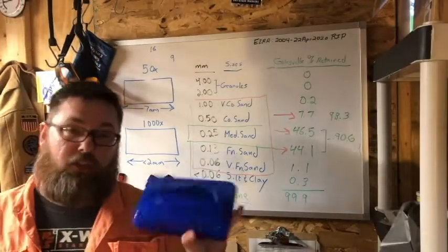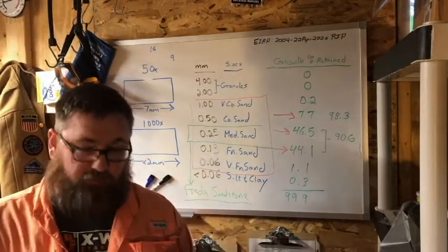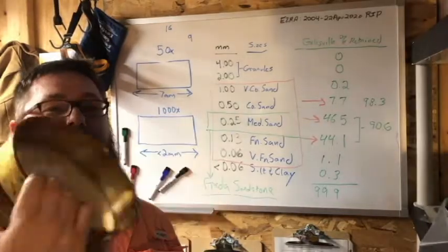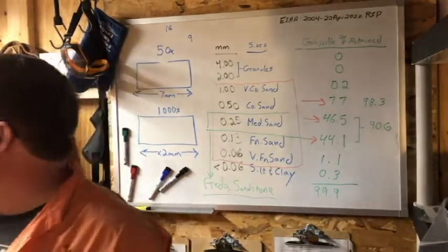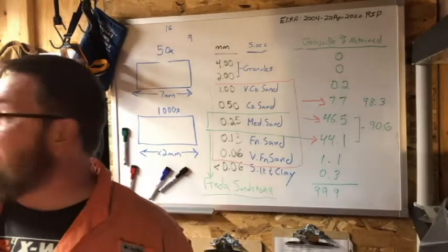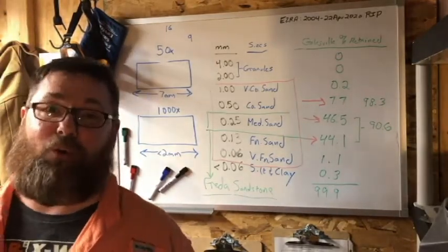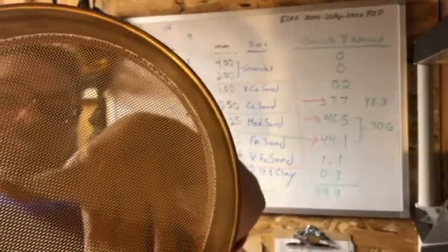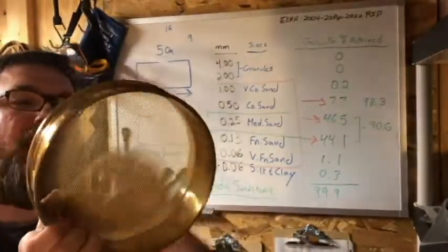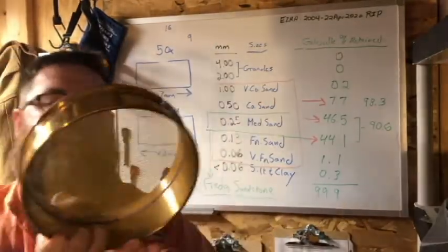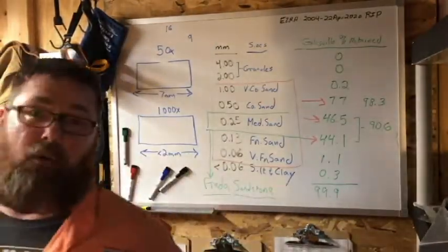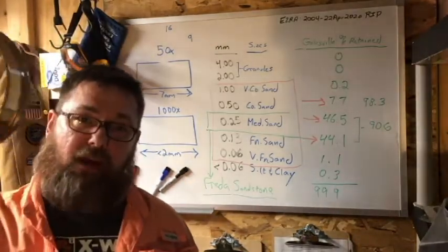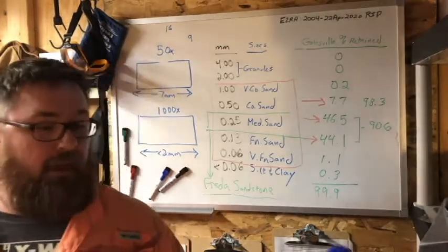We can use things like this to confirm other test methods we've used. This is my 18 sieve. The steel sieve sets didn't come with an 18—they skipped it. I had to buy a brass one independently. Here you can see how some stuff gets stuck in there. You generally just use your fingers and tap it lightly, and it'll get out for the next sample. So we use one method to get our analysis—the mechanical method's really reliable—and we can confirm it with this.